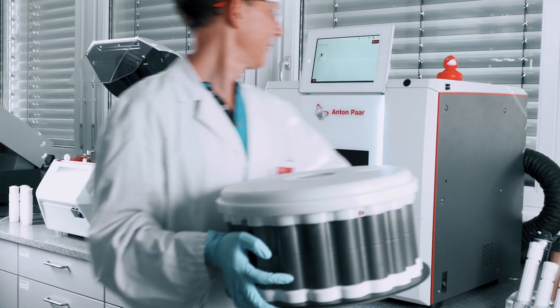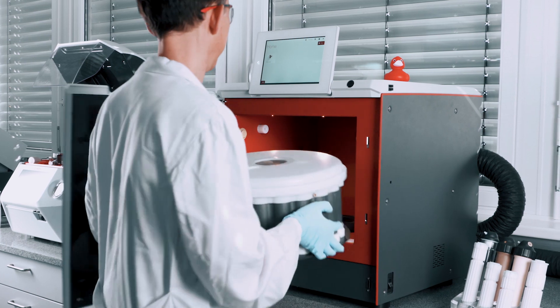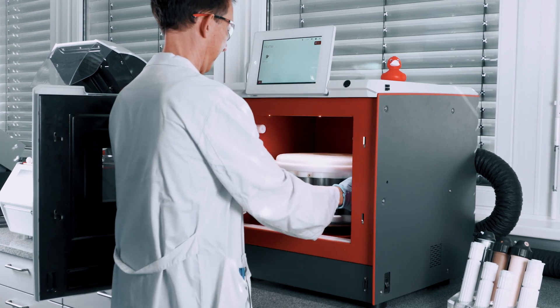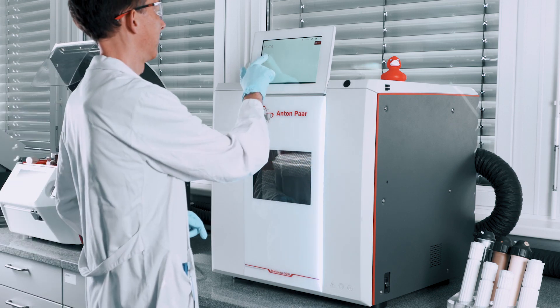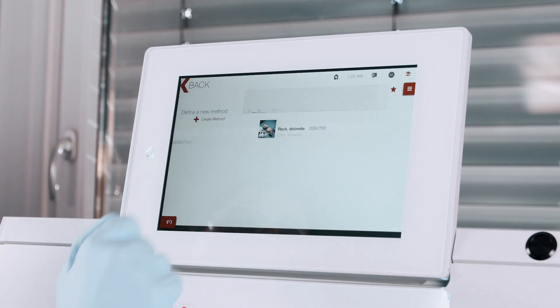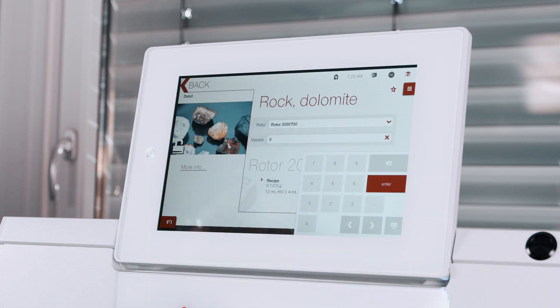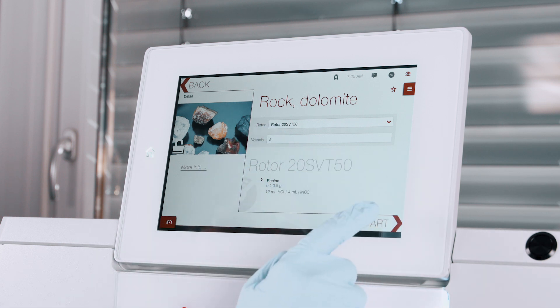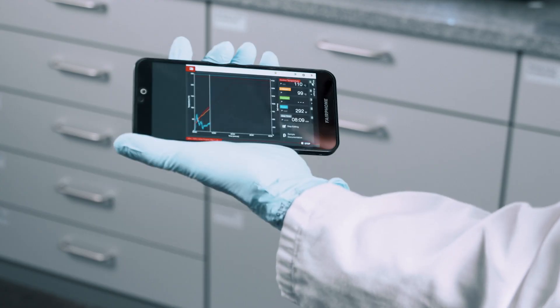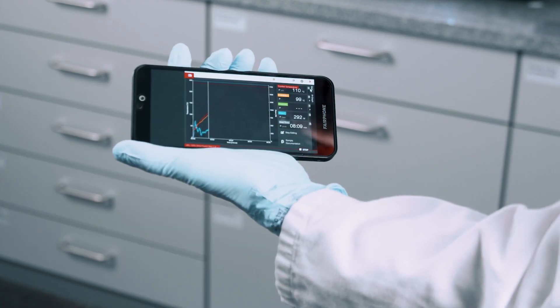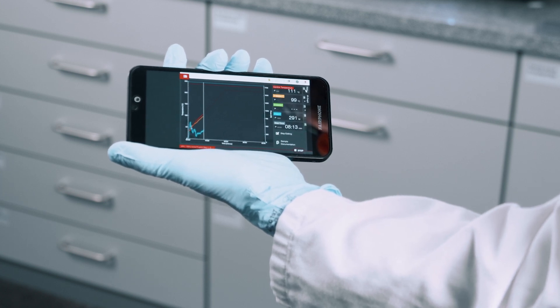Open the instrument, put in the rotor, and close the door. Now we choose a method from the library and press start. You can even operate the instrument from your phone. When the process is finished, you receive an alert on the phone or on your PC.